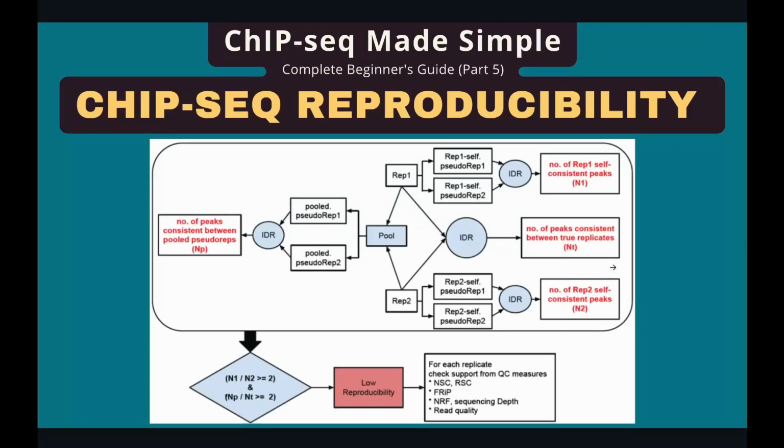In this video, I'm going to show you how to confidently identify reproducible peaks in ChIP-seq data. A major problem of ChIP-seq data analysis is that peaks identified in a dataset are irreproducible. Unlike in RNA-seq data analysis, which has a fixed number of genes, in ChIP-seq data analysis, depending on the person, tools, and the parameter setting, identified peaks can vary significantly. This tutorial demonstrates how to control this variation and generate a set of reproducible peaks.